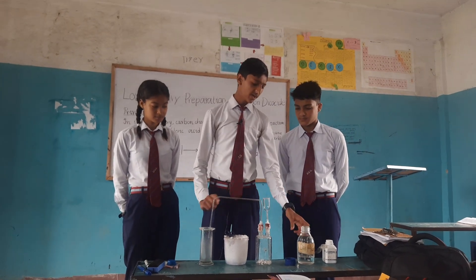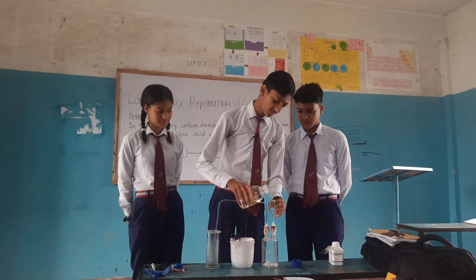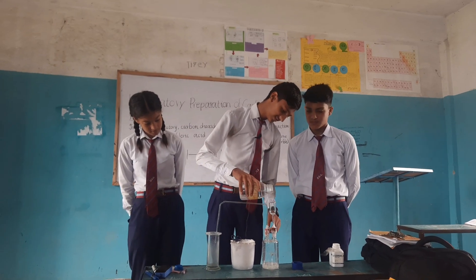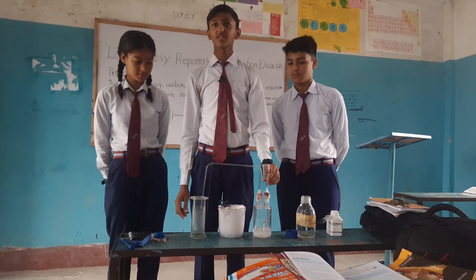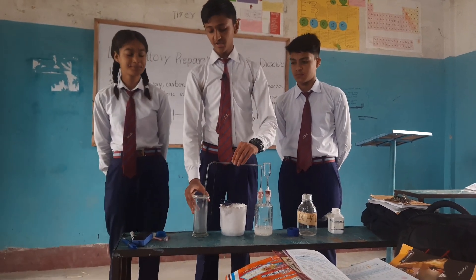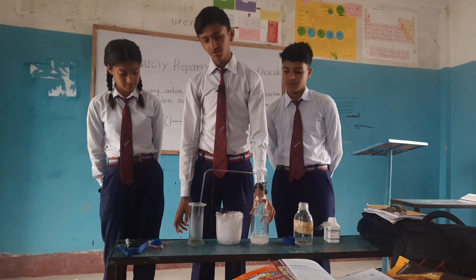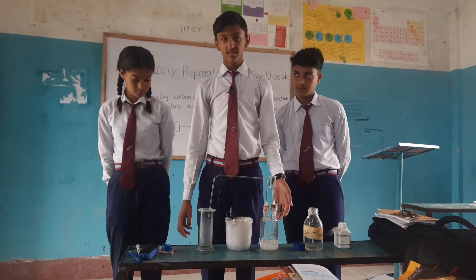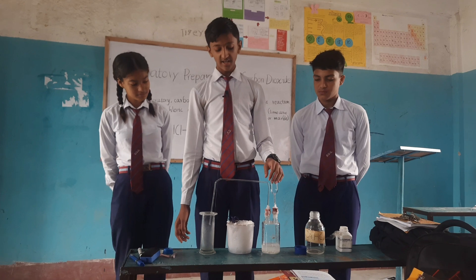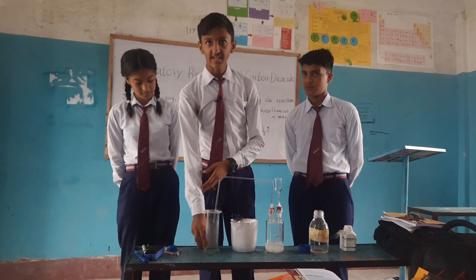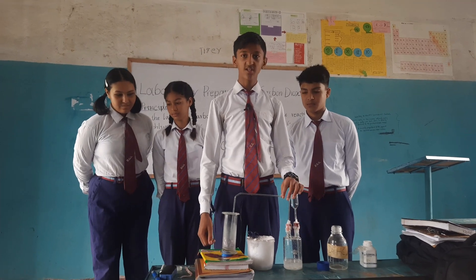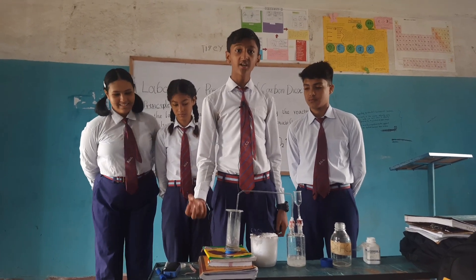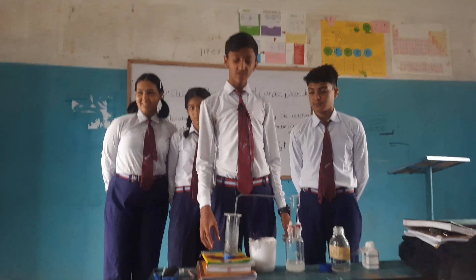We pour dilute hydrochloric acid through the thistle funnel into the Wolf's bottle and keep the delivery tube sealed tight. The reaction between limestone and dilute hydrochloric acid occurs, producing carbon dioxide gas. This gas is passed through the delivery tube and collected in the gas jar by the upward displacement of air, because carbon dioxide is heavier than air.